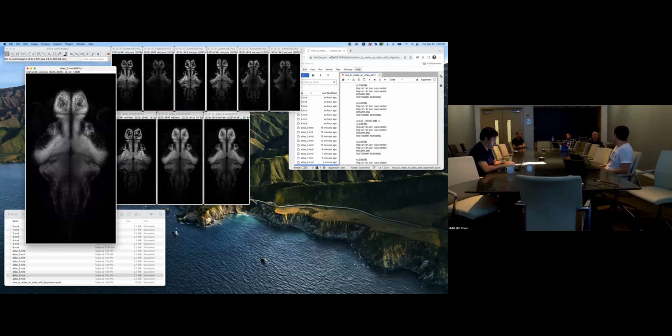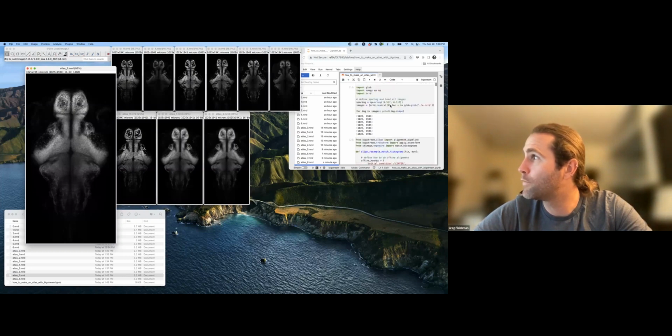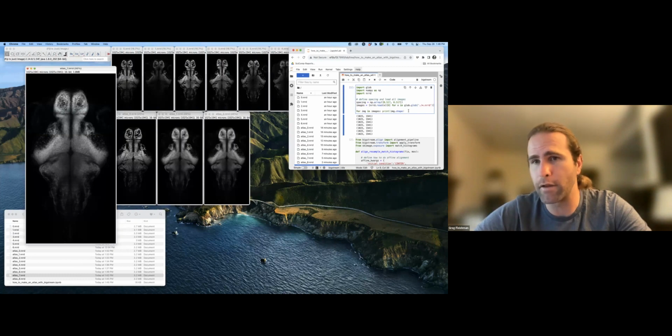Right, can you put this notebook on the wiki for how it's done? Yep, the notebook and the slides, I'll put both on the wiki for how to. And I'll leave this data in the same location that's indicated in the notebook. So if you want to just try it right off the bat with the default data as a test, that's fine. This is a small amount of data. I can leave it there for a long time. Eventually, I'll probably delete it, but maybe in a year.